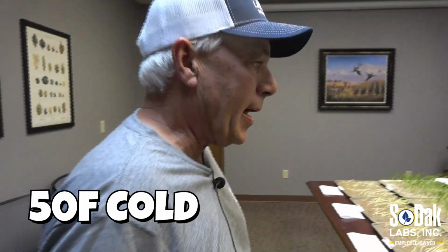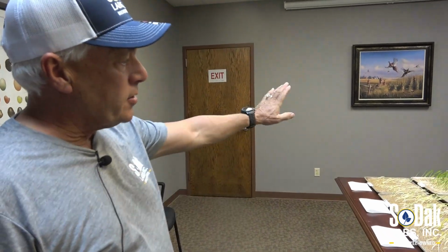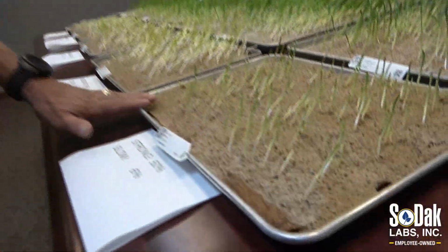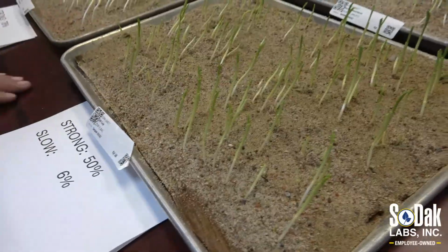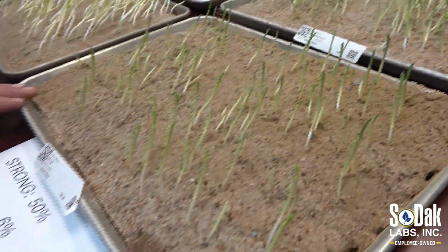All right, so we're back. What we did is we moved our sand germ, warm germs to the back, and then we added our 50 Fahrenheit cold tests in front of them. So what we're doing in a cold test, we're doing 200 seeds, again on the TCS method. But the thing at SoDak is we make sure these seeds are definitely imbibing 50 Fahrenheit water.